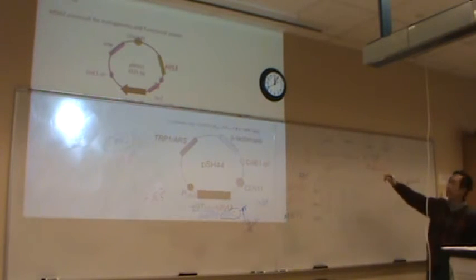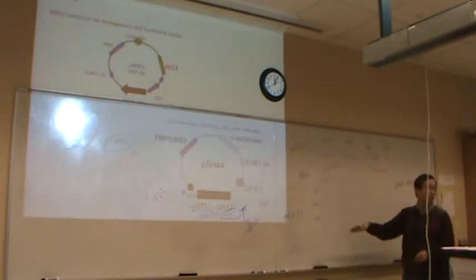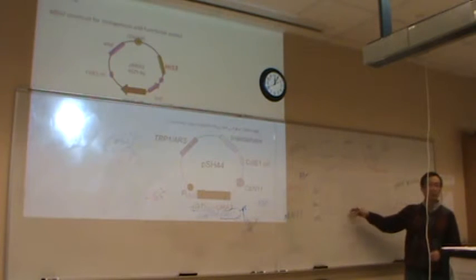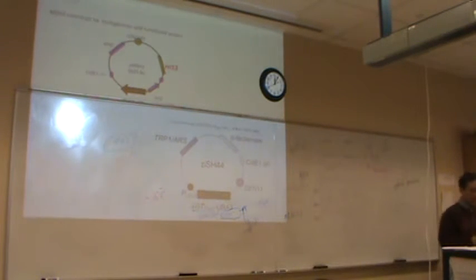That's our media, this is the media we are going to use. And that's our experimental schedule, procedure. And that's the plasmid we're going to use. So you should write those in your notes. But of course, on your lab report, on your Google Doc, that information should also be there. That's really the key for the whole project.